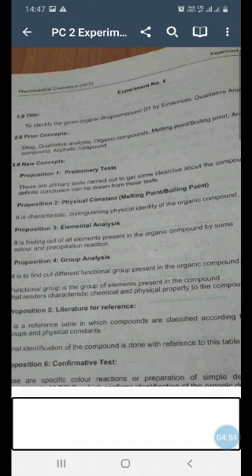So remember one thing, even if your compound is soluble in the first group, still you have to go on carrying the test till last. If your compound is a member of group 1 and group 2, still you have to proceed further till the end. Even if your compound is a member of group 1, group 2, or suppose group 1 and then group 3A, still you have to perform till the end.